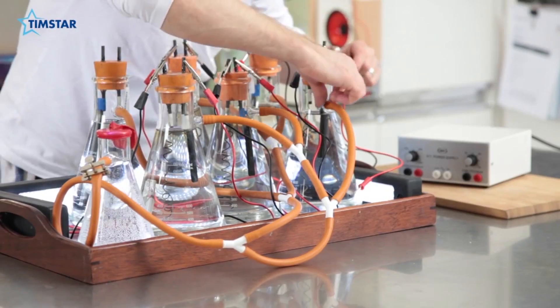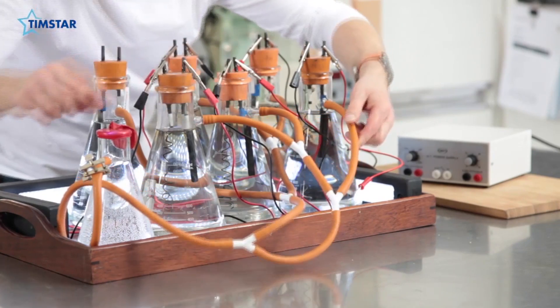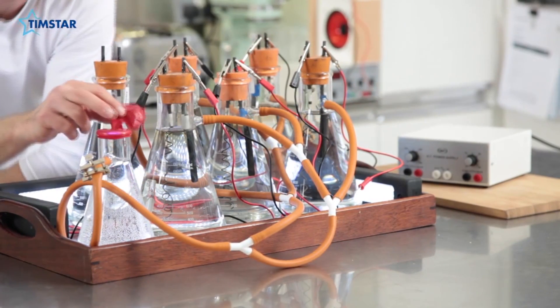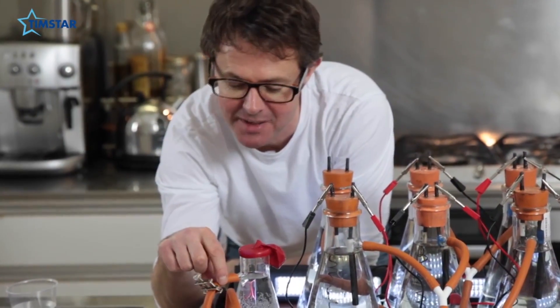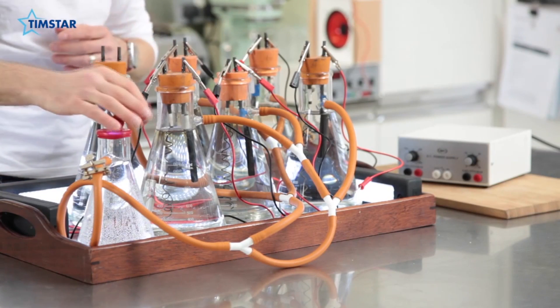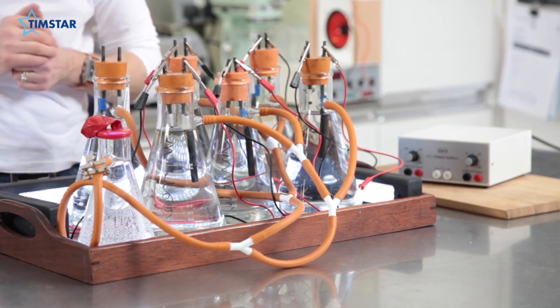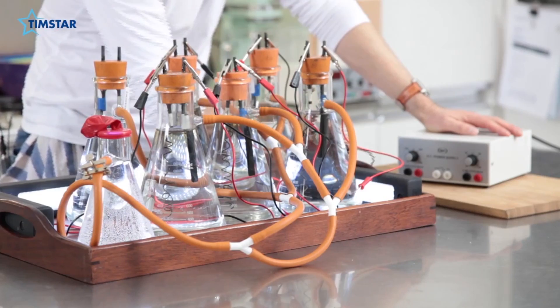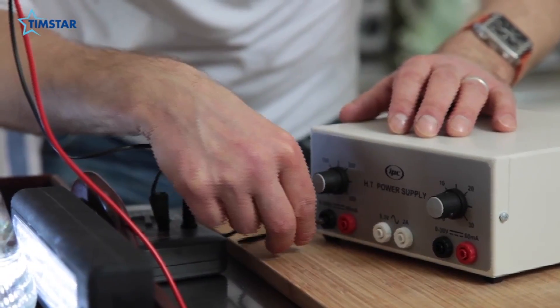Each of the filter flasks has a little nozzle, and these are connected by a series of tubes into one final smaller filter flask with a Hoffman clip on the end of the last bit of tubing and a little rubber balloon. If this works, the pressure will build up so much that the balloon will have to expand to cope with it. You need to hook it up to a high-tension power supply, connected through the ammeter so we know what the current is going to be, with the negative contact here and the positive contact here.